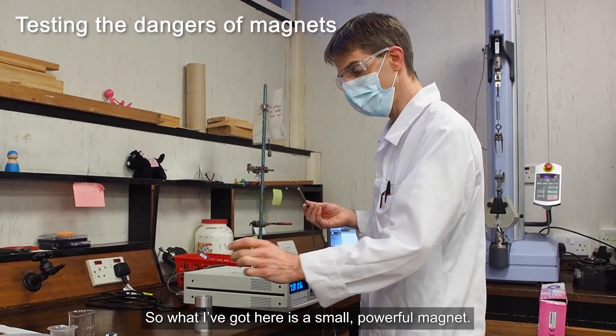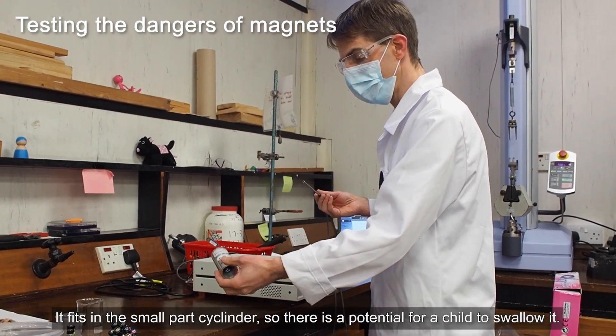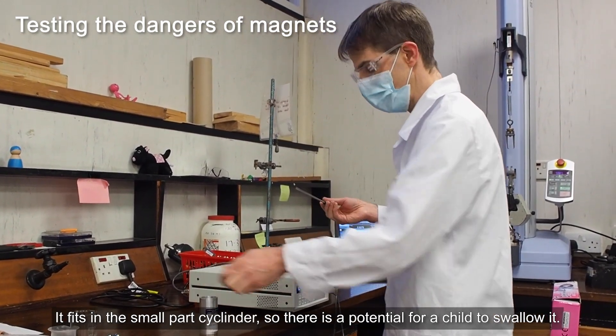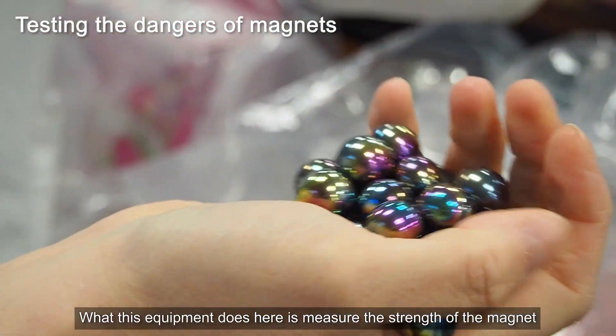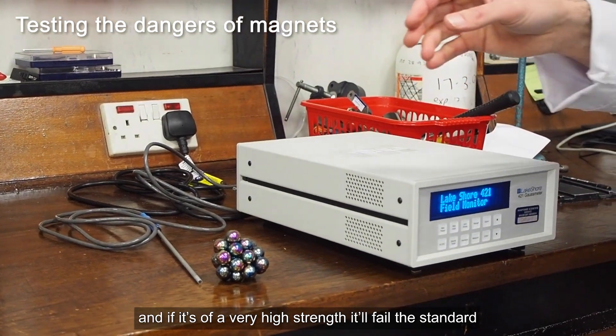What I've got here is a small powerful magnet. It fits in a small part cylinder so there's a potential for a child to swallow it. This equipment measures the strength of the magnet, and if it's of a very high strength it will fail the standard.